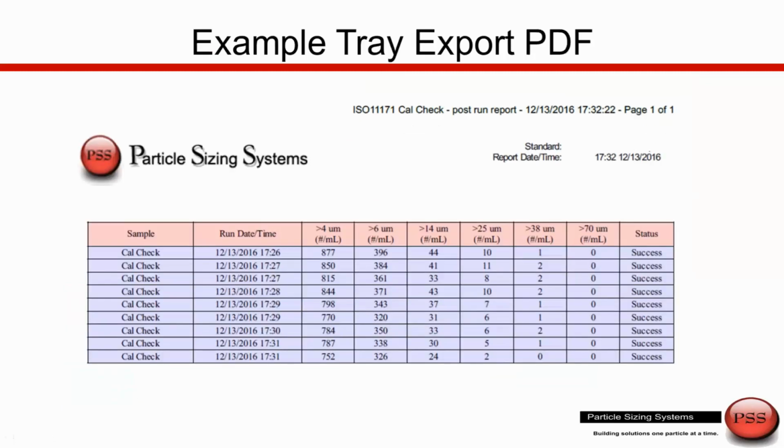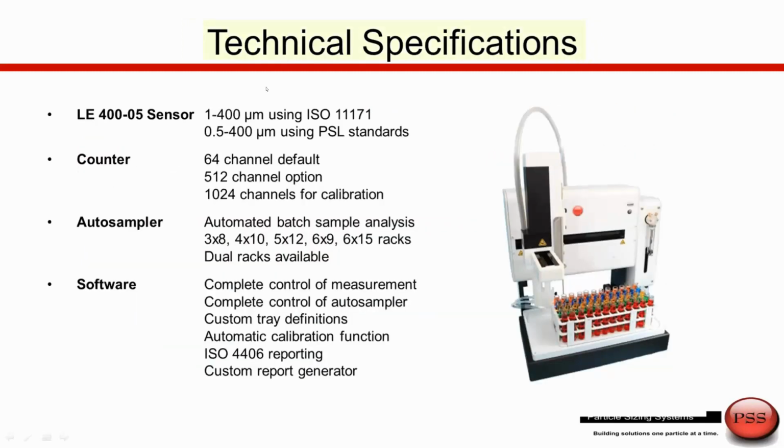We can also report this information as an Excel spreadsheet or report for all of the data in a given tray. So if we're going to have a high throughput situation, maybe we're running 200 samples per day through the lab, sometimes we just want spreadsheets or single pages, which gives us all of the data for all of the tubes. And this is showing how we can also accumulate the data, present it in written reports, electronic reports, or we could export this data to the laboratory LIMS system. So that's data reporting.